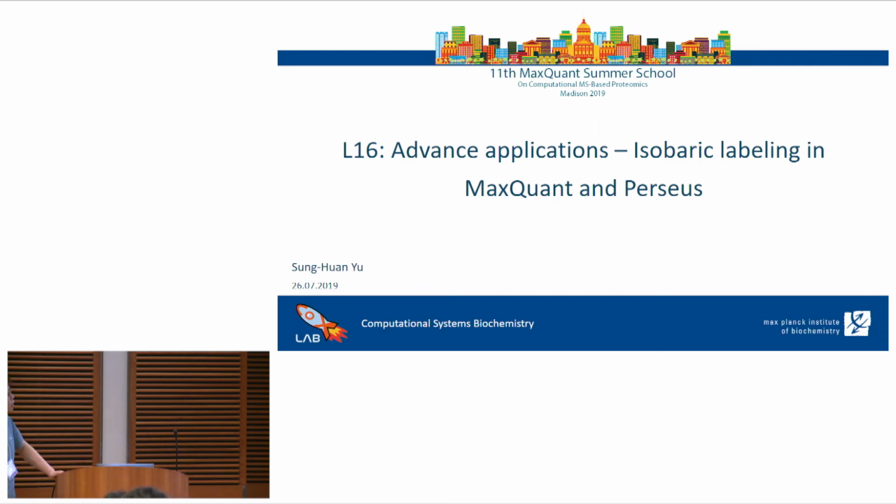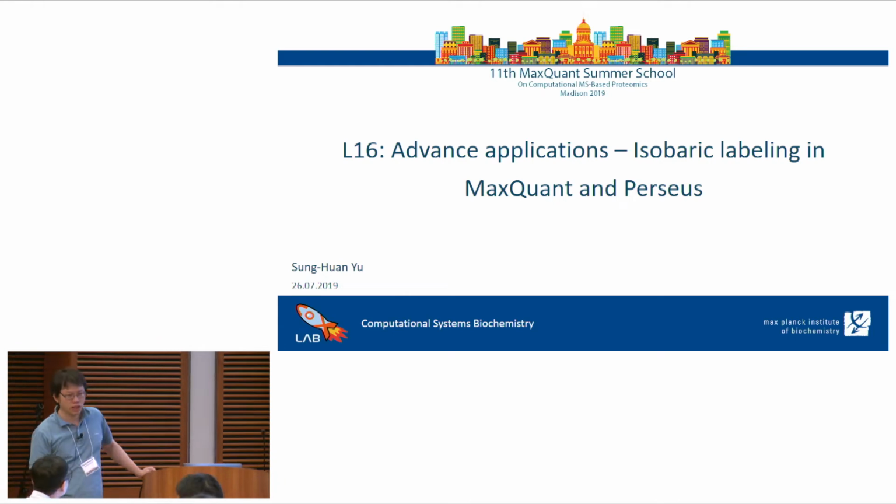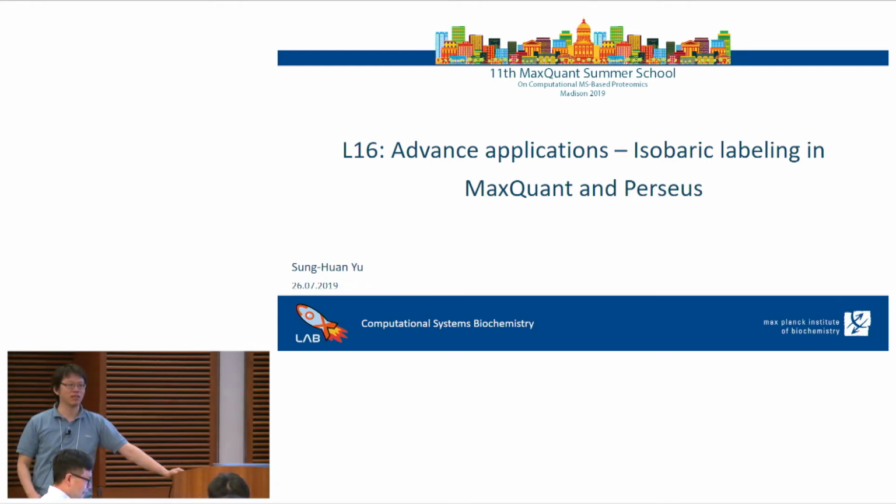For these sections, I will talk about advanced applications, mainly for isobaric labeling in MaxQuant and Perseus. I think during this summer school, we have been asked so many times about TMT.